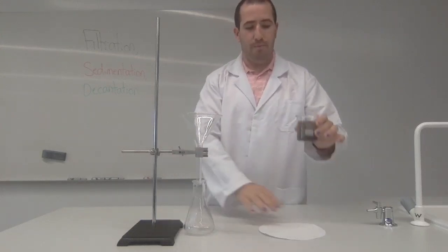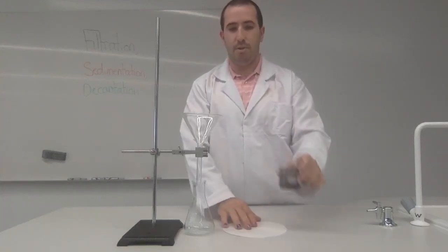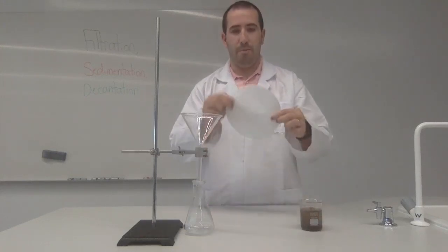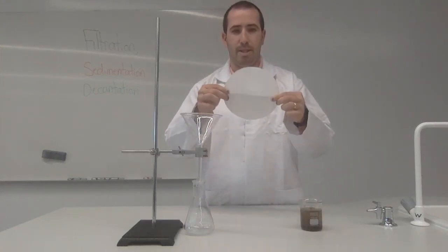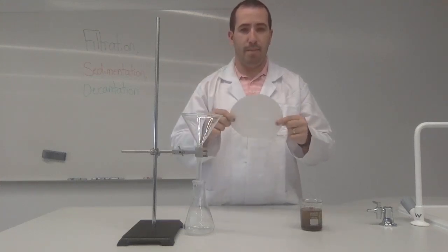So we've got this water. So what we're going to do now is just to decant this into it. But before we do so, let's add some filter paper into it. Now how do we add the filter paper into our filter funnel? A few very easy steps.